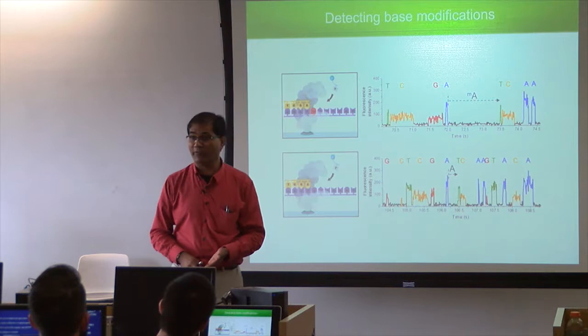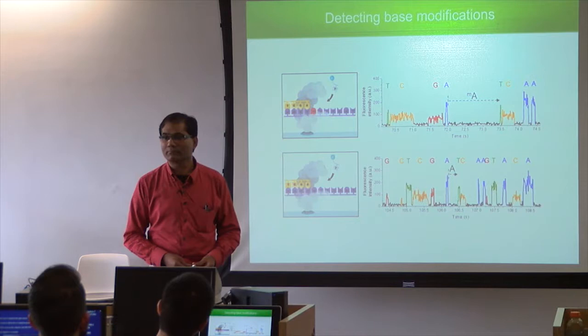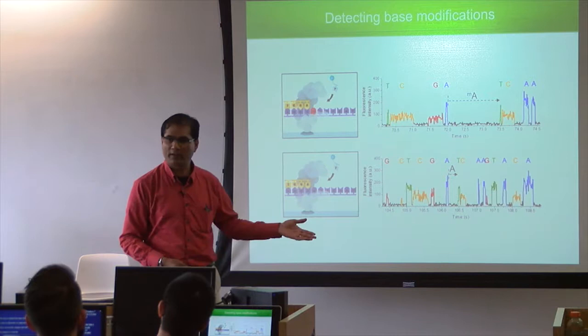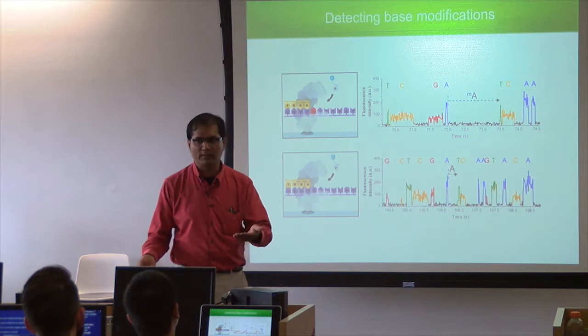It would seem like you have to very tightly control conditions like temperature. Yes, of course. It's an enzymatic reaction. That's why this machine is big. It is very expensive, $700,000. How do they deal with temperature fluctuation? You have Peltiers inside, modules where there is a typical temperature for the reaction. All the Illumina machines have Peltiers that change the temperature. When you are doing amplification, you have to have the PCR conditions there. The temperature changes, yes. That's why these instruments get expensive. Sequencing is cheaper, but the machines are still very expensive.